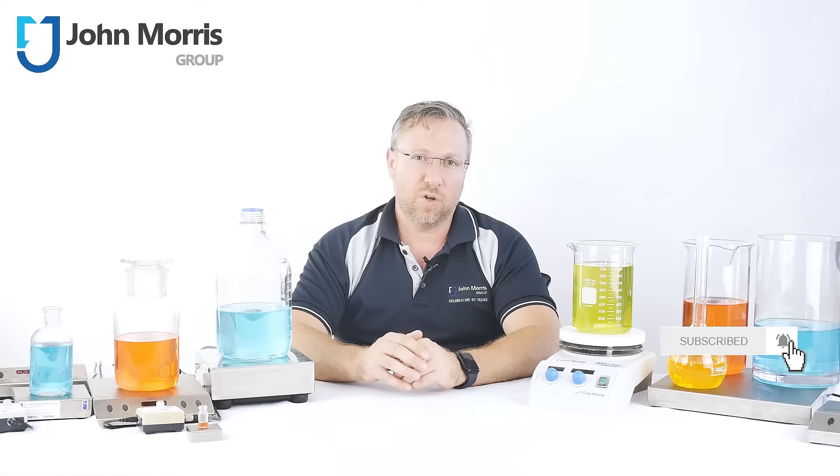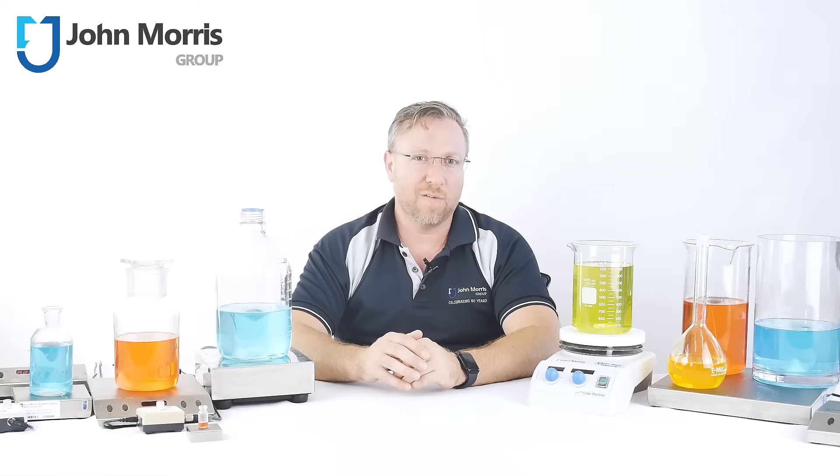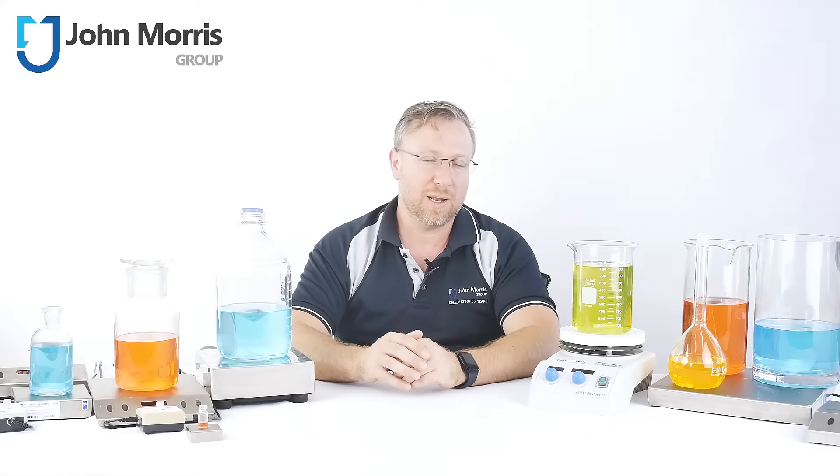But today we're going to talk about a key requirement of any laboratory, the trusty magnetic stirrer.